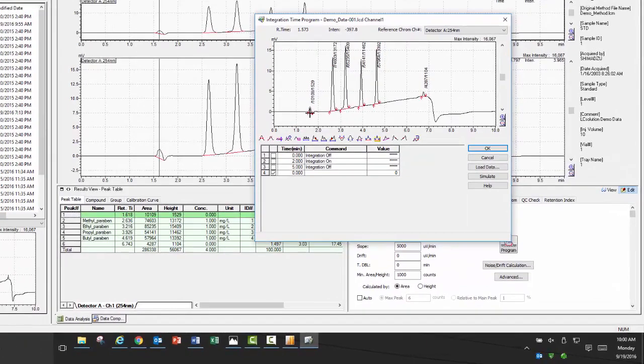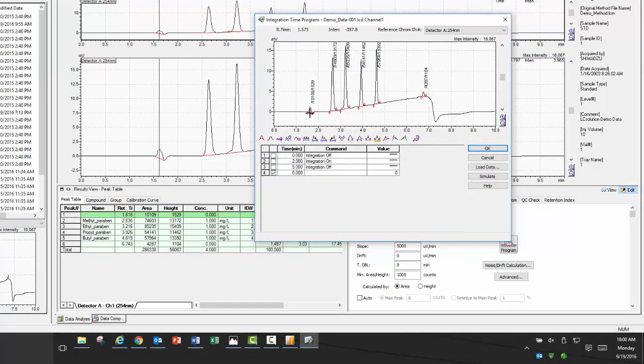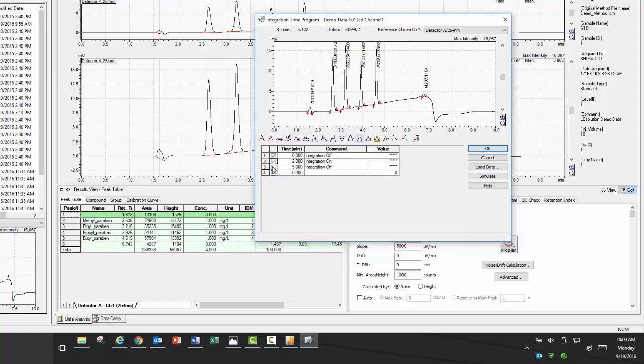In this example, I have four peaks of interest but I also have a solvent front and a peak that I am not interested in. The easiest integration tool to use is the integration on and off features. This lets you specify the window of interest within the chromatogram to look at your peaks of interest. Once you have your window specified, to preview it, click simulate.